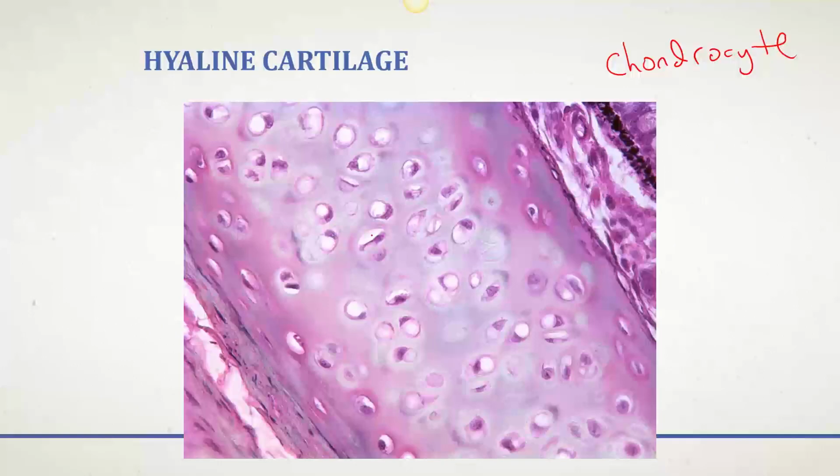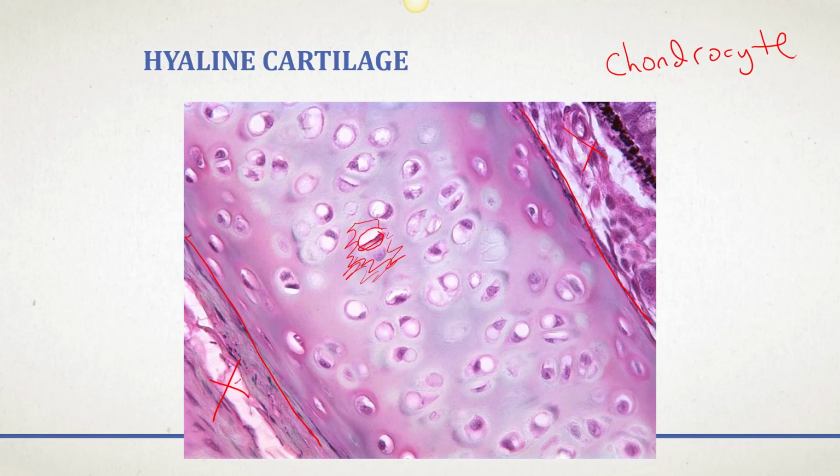What we see here is this chondrocyte trapped in a cavity. Now the chondrocyte has sprayed out this extracellular matrix here. And it sprays it out and then gets trapped in the center of this tissue. Here are the boundaries of the tissue, and here are where you're going to have nutrients that need to supply all of the cells in this tissue.